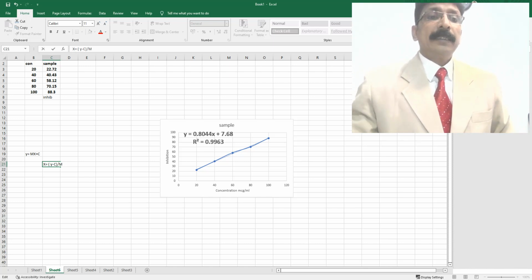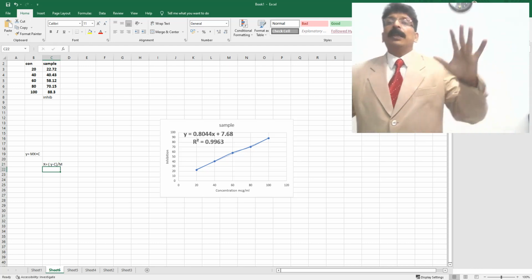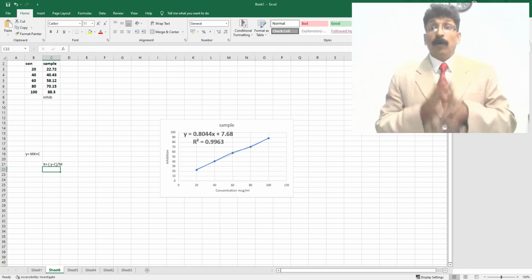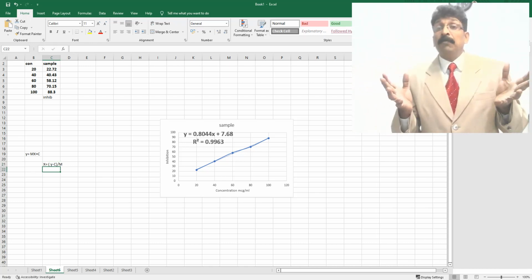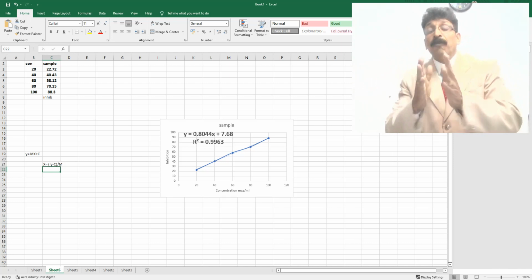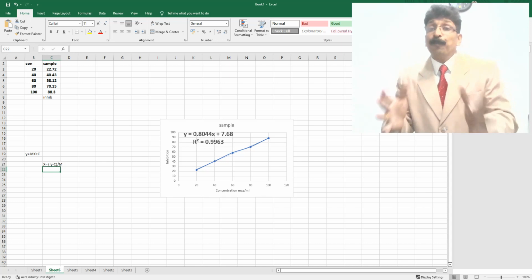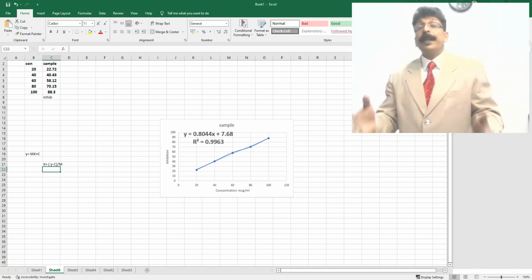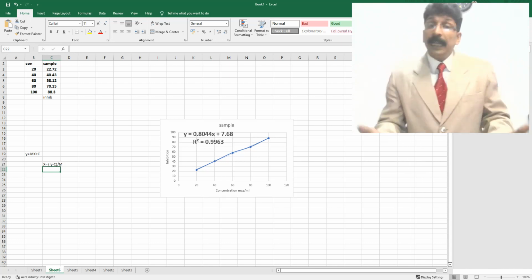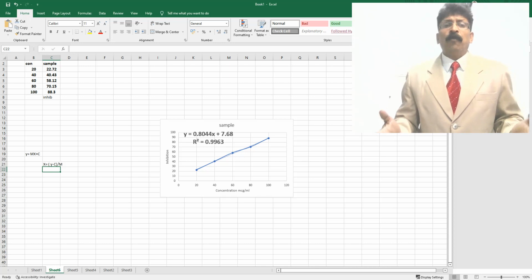That is the x value: when you take y as 50, you will get the x value for 50. X is concentration. So we are going to find out the half maximal concentration of the antioxidant activity. If you make y 50, you will get 50. If you make it 90, you will get 90. Understand? That is the main aim of finding the x value.